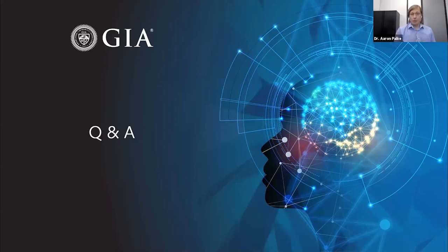Yeah, that's a really good question, actually. In the laboratory, we basically use 3 lines of evidence to make cobalt color calls. The first is basically just the color of the stone. It has to fit within a certain range of colors that we expect for cobalt spinel. It has to have that bright, vivid blue color. If it's too dark or too light in tone, or if the saturation of the blue color is too low, it's not going to qualify as a cobalt spinel.